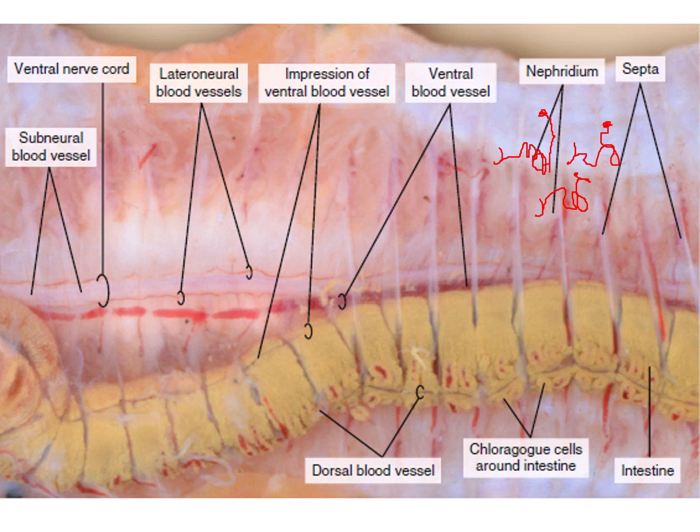The excretory system of the earthworm consists of tiny tubular nephridia. They are also called metanephridia because they have both openings, one is the nephrostome and the other is the nephridiopore. The nephrostome is a funnel-like structure that opens in one segment through the septum, and then the rest of the tubule is present inside the next segment, and then there is a nephridiopore, a pore that opens outside of the body.